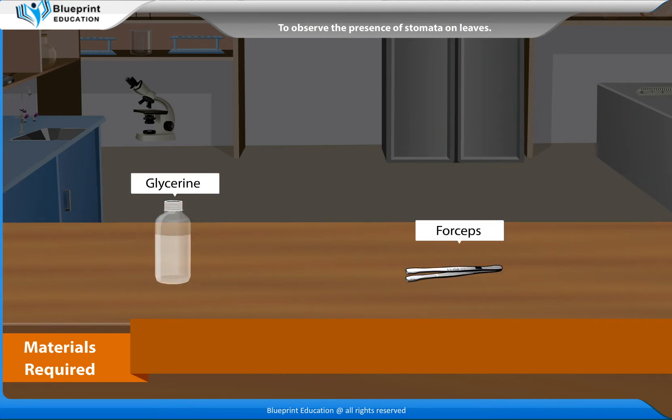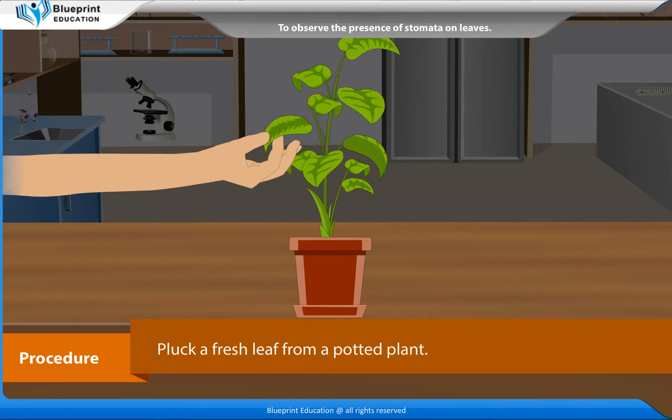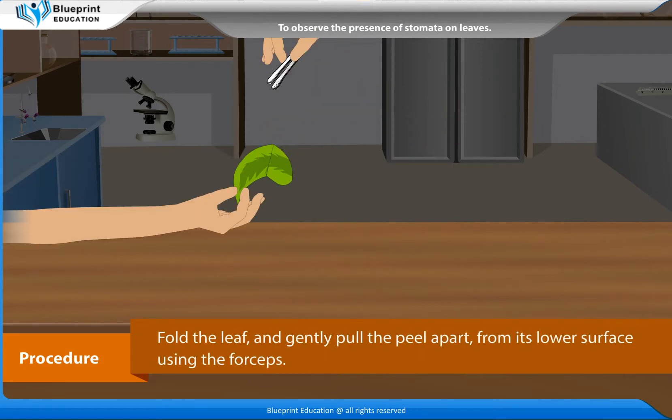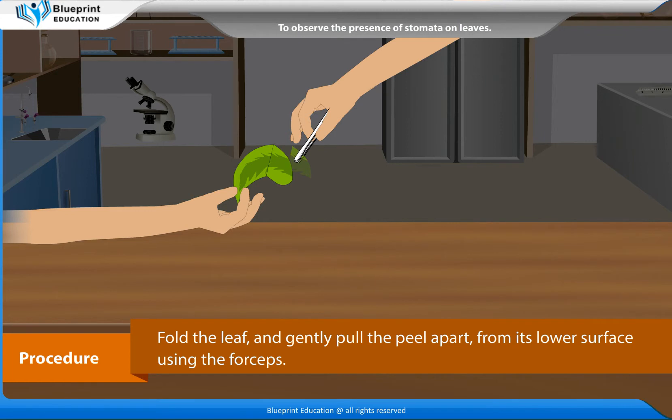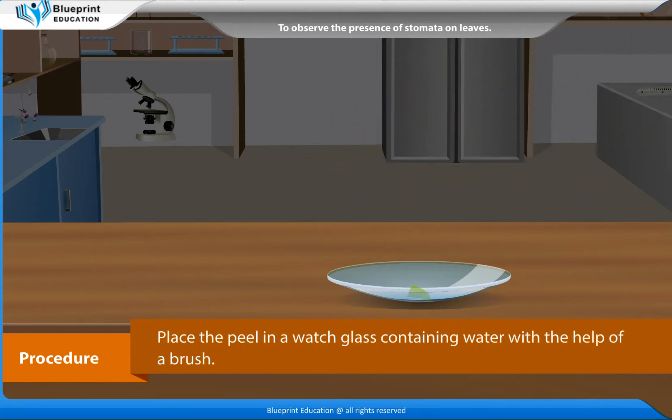glycerine, and forceps. Procedure: Pluck a fresh leaf from a potted plant. Fold the leaf and gently pull the peel apart from its lower surface using the forceps. Place the peel in a watch glass containing water with the help of a brush.